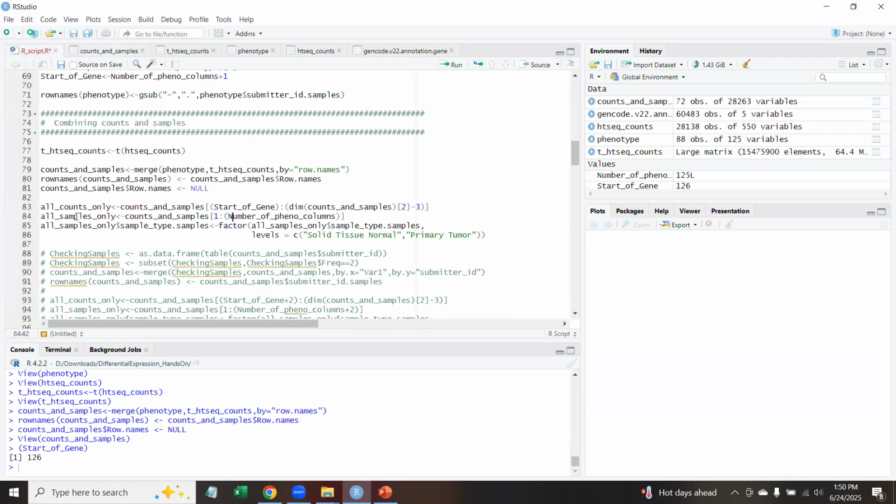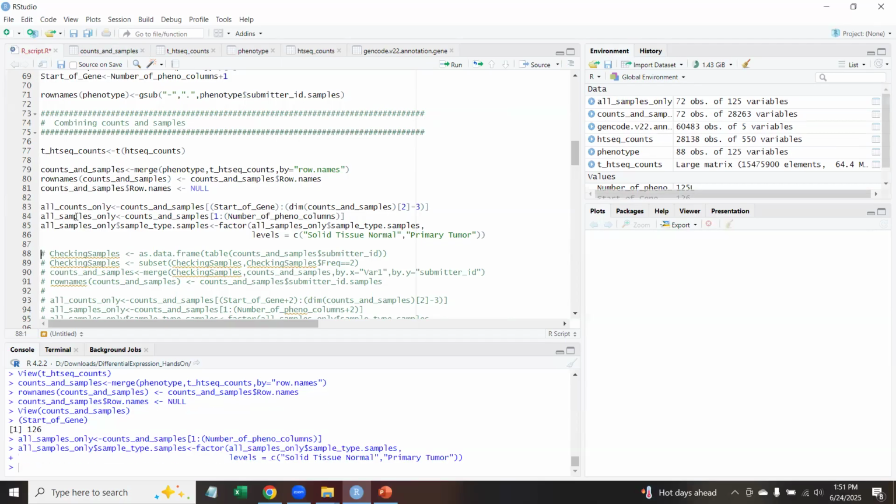This seems silly, I know, but it's the best way I know how to ensure that the samples are the way we need them to be. If there's a way that you would prefer to do it, you're welcome to do it that way. Coding is you write code in the way that makes sense to you. If you want to use a bunch of lines of code to do what you need to do, that's fine, as long as you understand what you're doing and you can come back to it next week, next year, and understand what you did.